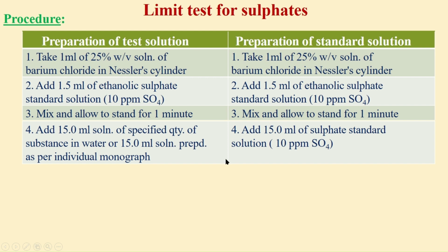In the standard solution, instead of this specified substance, we add 15 ml of standard sulfate solution, which contains 10 parts per million of sulfate ion.